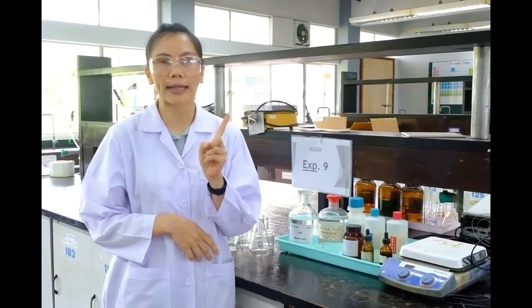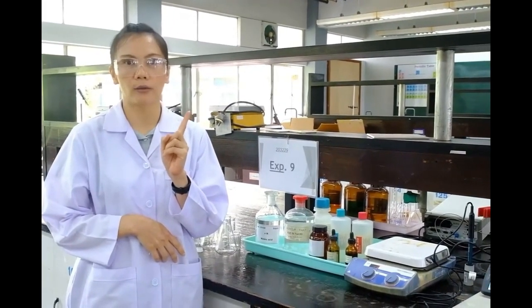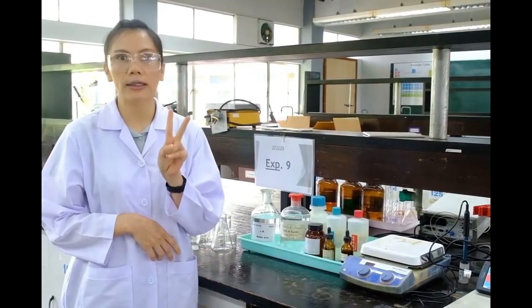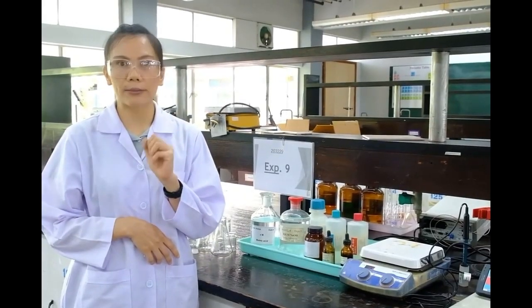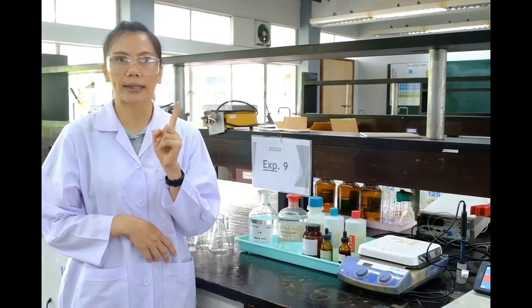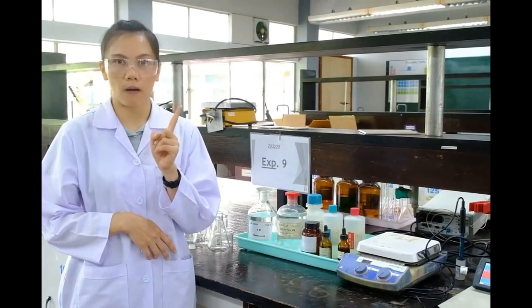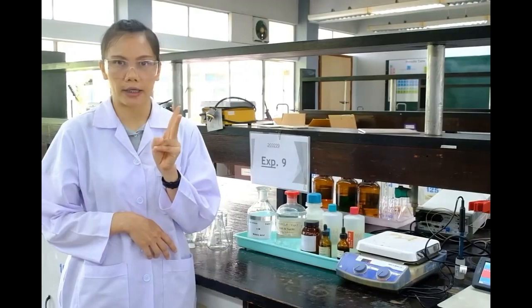The experiment consists of two parts. First, we'll standardize the sodium hydroxide solution. Second, we'll titrate by measuring pH. The pH measurement part will also consist of two experiments. First, you'll perform a rough titration to find a rough endpoint. The second will be creating the titration graph.